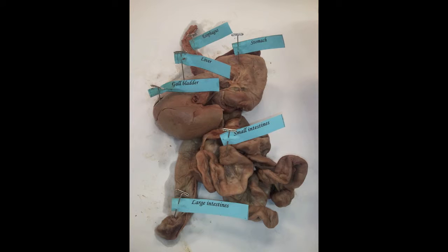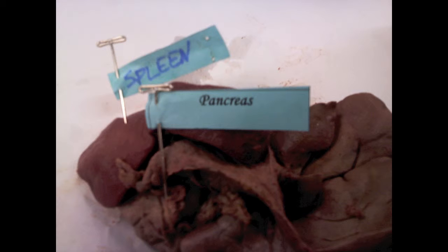The gallbladder aids in fat digestion and the storage and concentration of bile. The pancreas produces enzymes that are used to break down carbohydrates, proteins, lipids, and chyme.